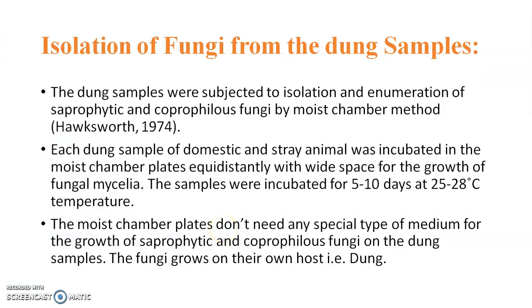Isolation of fungi from the dung samples. The dung samples were subjected to isolation and enumeration of saprophytic and coprophilous fungi by the moist chamber method. Each dung sample of domestic and stray animals was incubated in the moist chamber plates equidistantly with wide space for the growth of fungal mycelia.